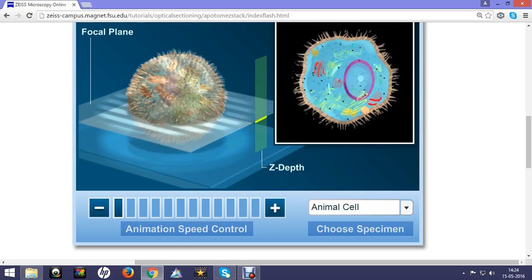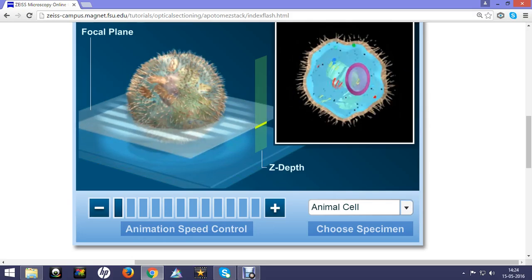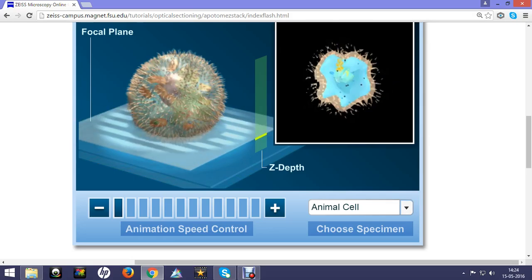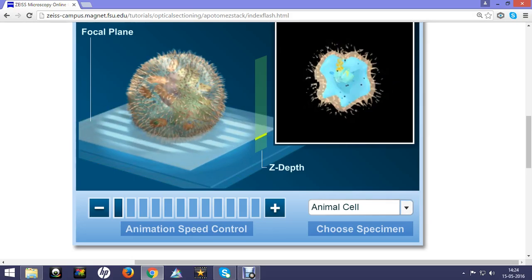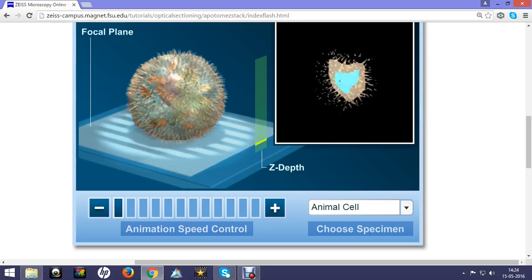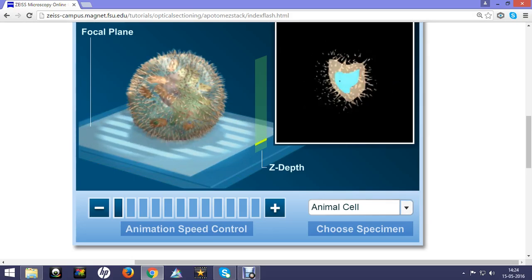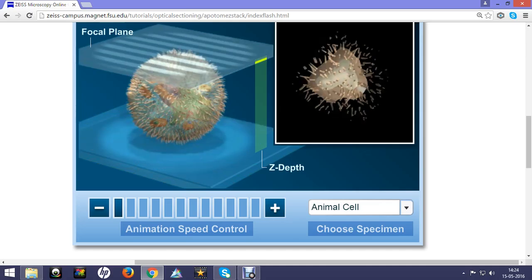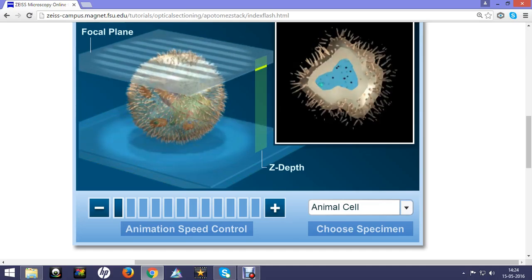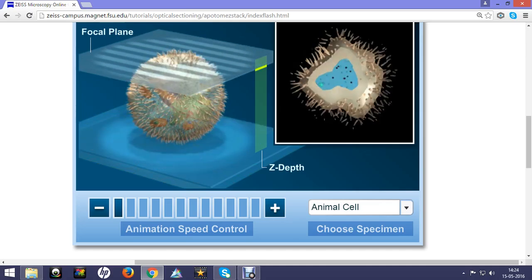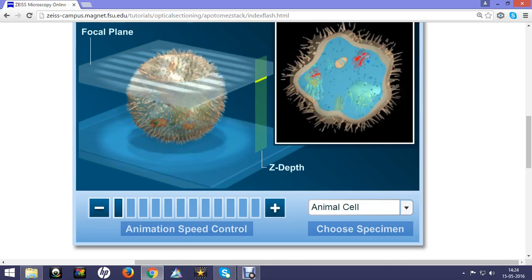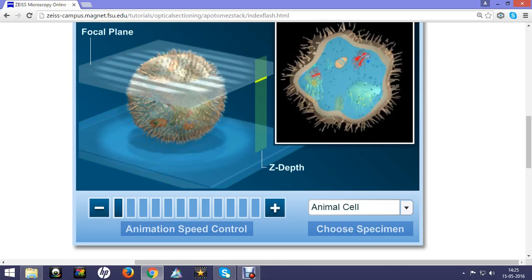If you look at the image on the left side you can see due to the motorized stage of the microscope the focal plane is changing every time point, and on the inset you can see the cellular details are also changing.